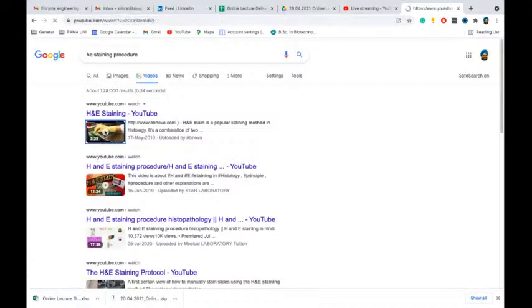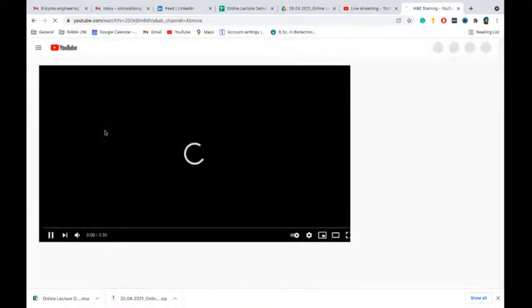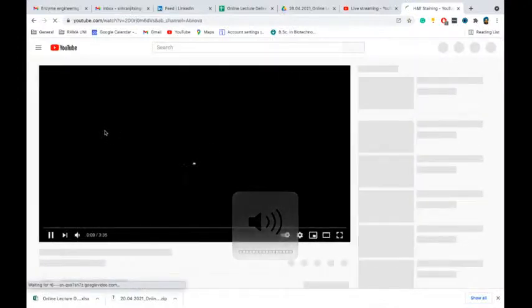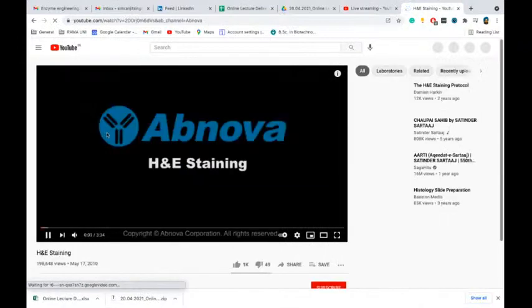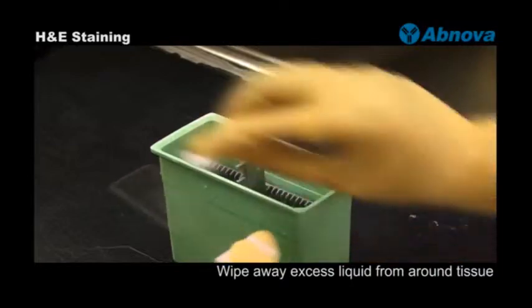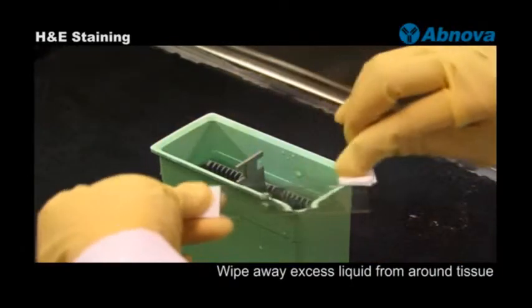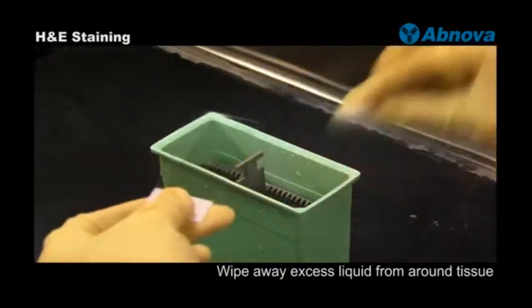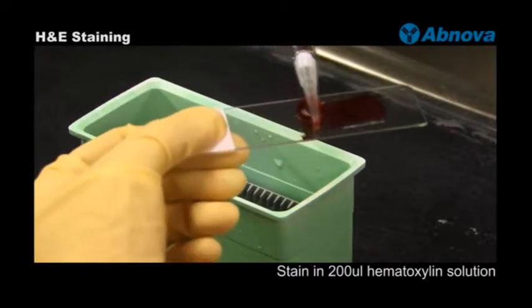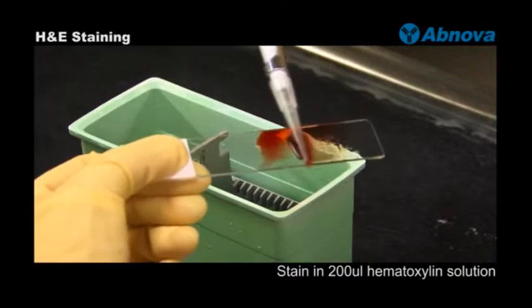Maybe I can show you one video regarding that. Hematoxylin solution.